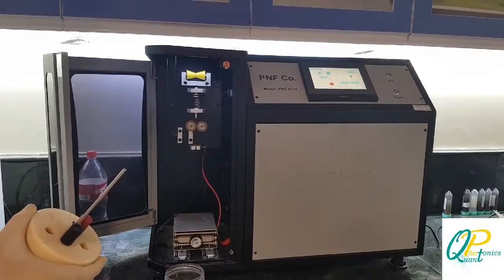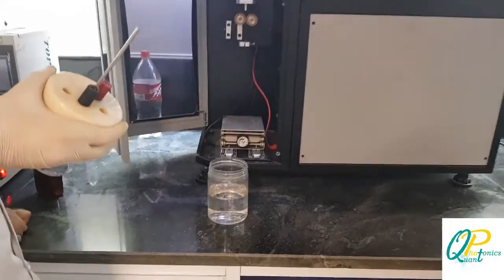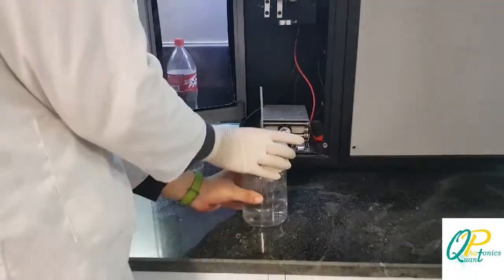First of all, for this experiment, we pour 400 milliliters of deionized water in the container, and we put the lid and close it to fix the container.